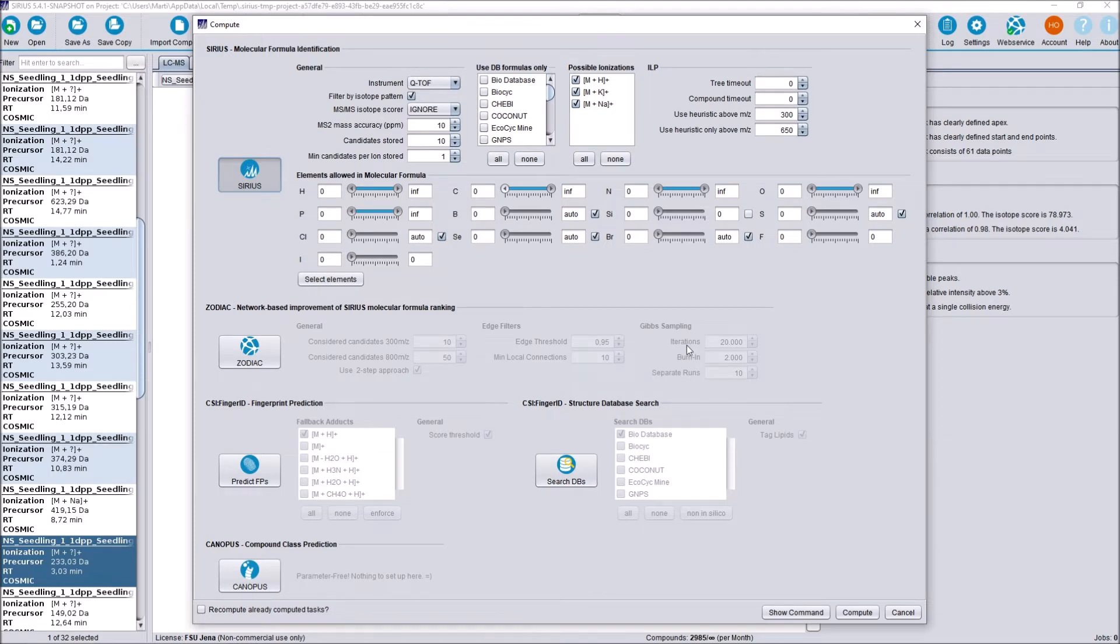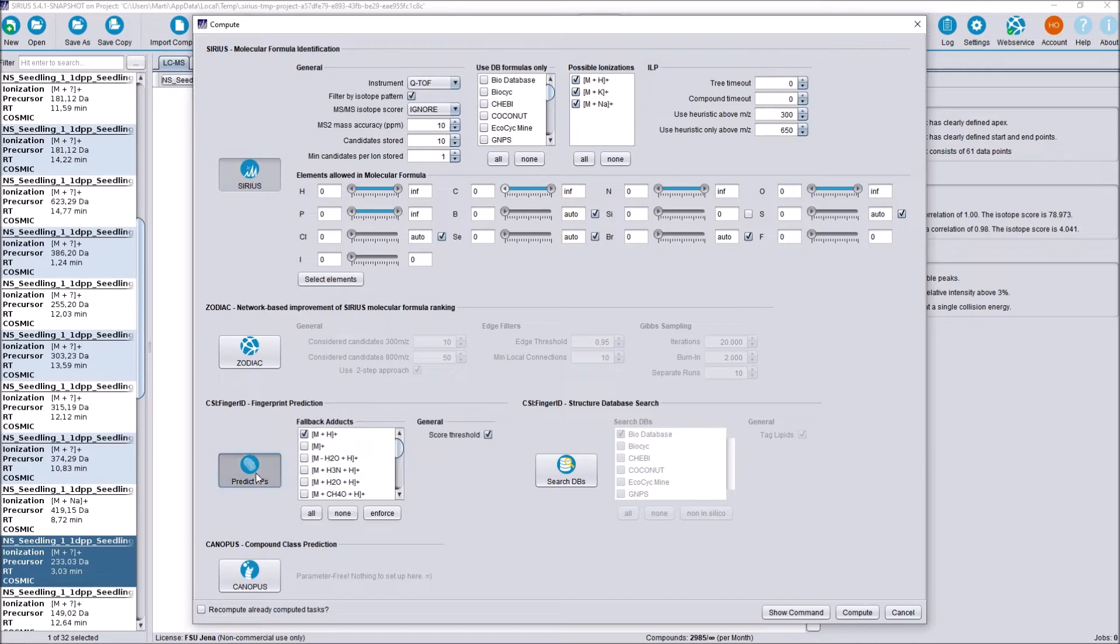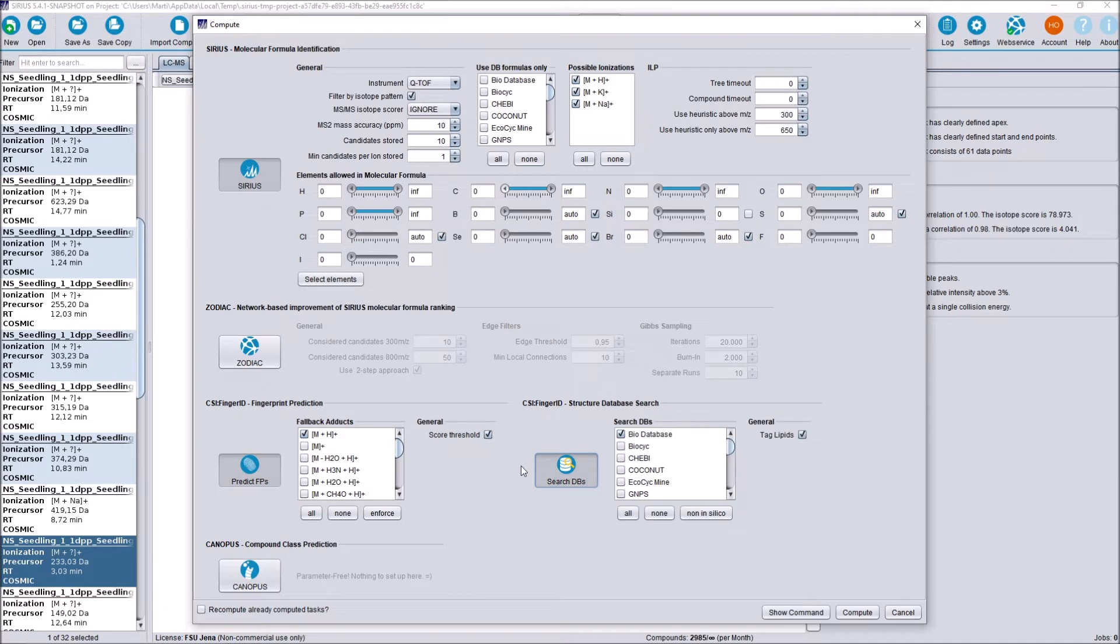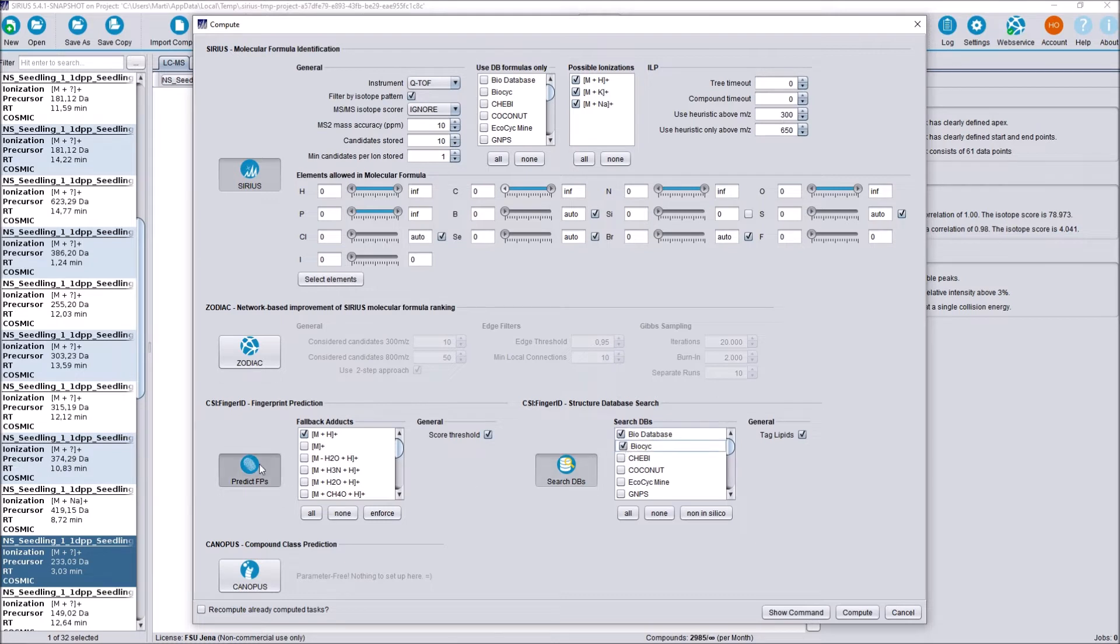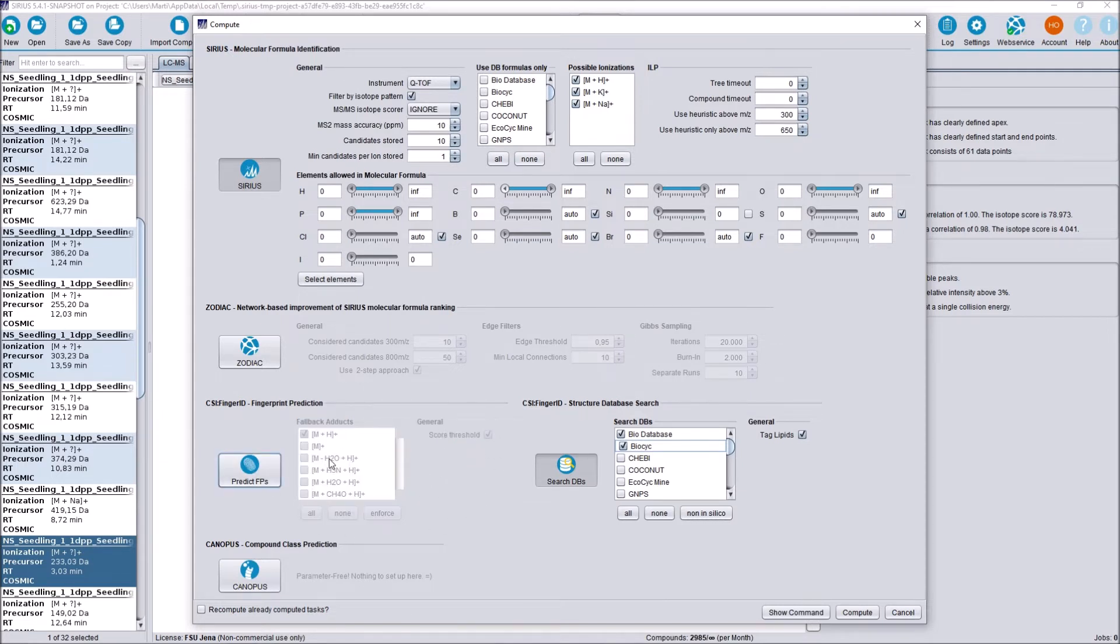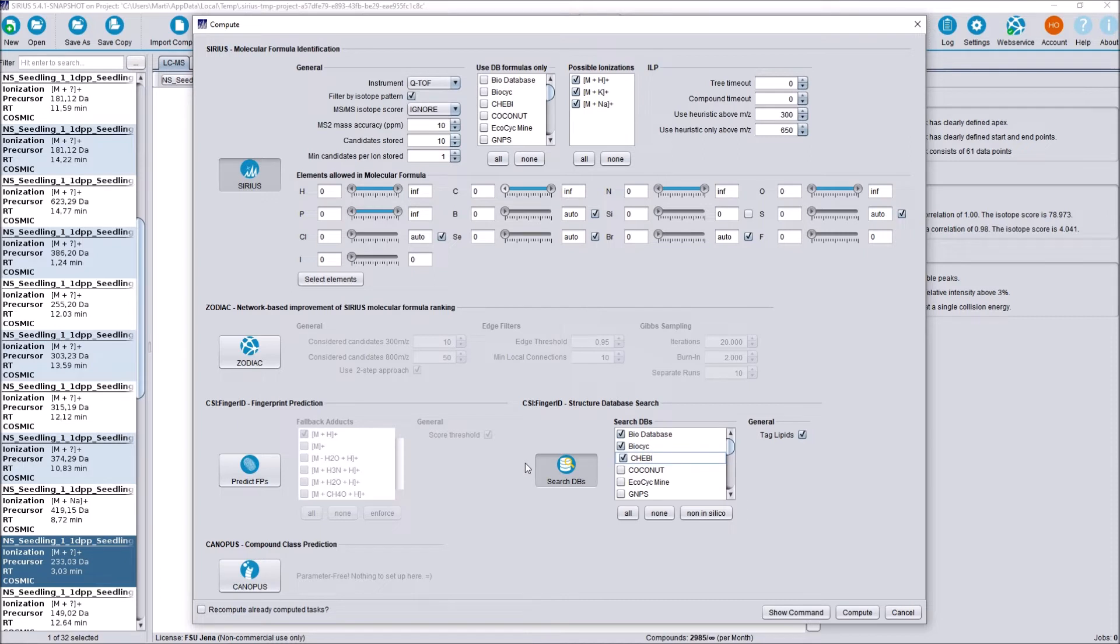For Zodiac, also nothing changed. The biggest change was made to CSI FingerID at the bottom here. Predicting the molecular fingerprint of a compound and then searching that molecular fingerprint in a structure database are now two separate modules. This allows us to change the database we are currently searching in without recomputing the fingerprint of a compound every time. Meaning, if you have predicted the fingerprints once and you are satisfied with them, you can turn this option off and just change and search the structure database in the right module here. This obviously saves a lot of computation time and also waiting time, because predicting the fingerprints can be computationally expensive.